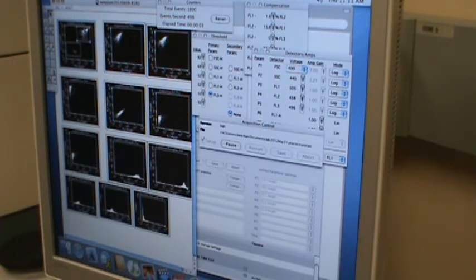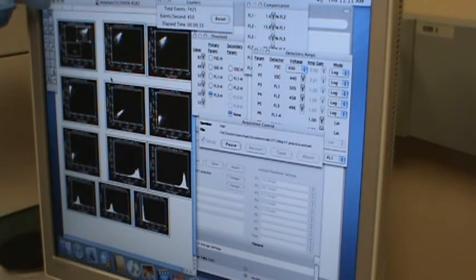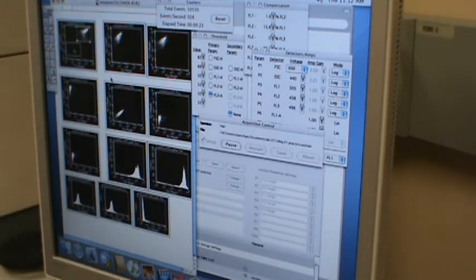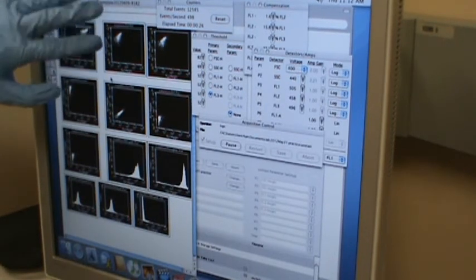I want to gate where the majority of the cells are. So that's the non-stained cell. So remember, FSC is cell size, SSC is granularity. That's the cell. For some reason now we see very few dust. That's a good thing. So this is FSC, cell size.